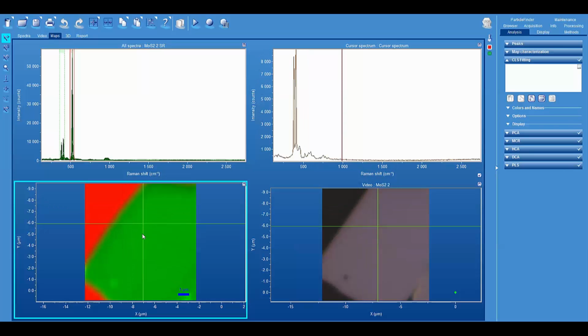So the important consideration right here for you is that the image was generated in 300 nanometer increments with 1 second integration time, and so this entire image took 22 minutes and 59 seconds to generate. And this is what you see using the peak bracket method.